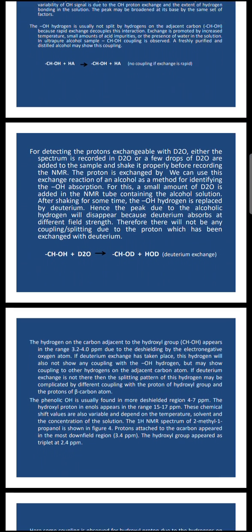For detecting the protons exchangeable with D2O, either the spectrum is recorded in D2O or a few drops of D2O are added to the sample and shaken properly before recording the NMR. We can use this exchange reaction of an alcohol as a method for identifying the OH absorption. For this, a small amount of D2O is added in the NMR tube containing the alcohol solution.